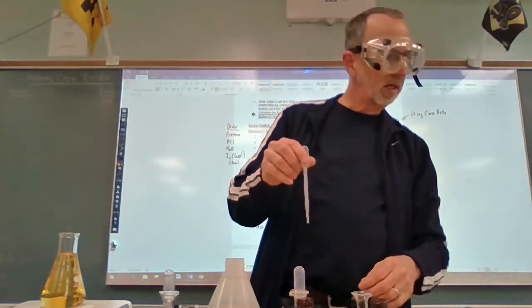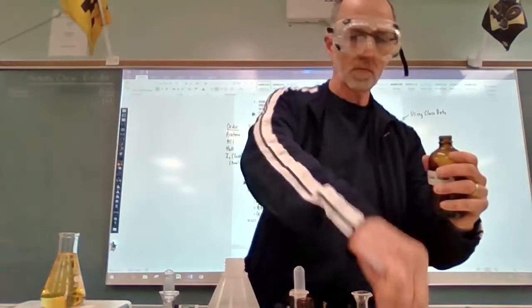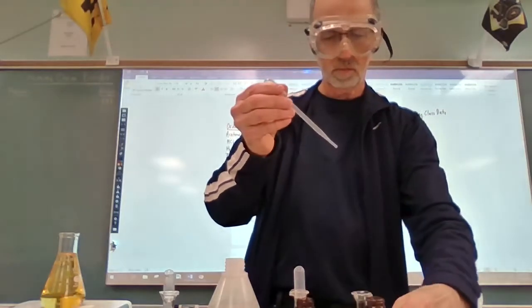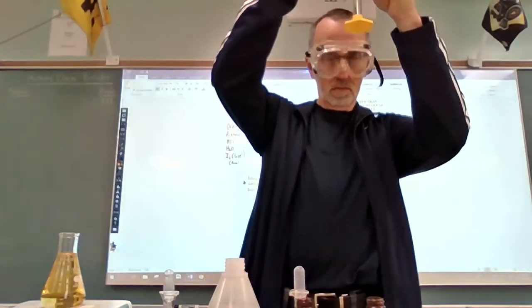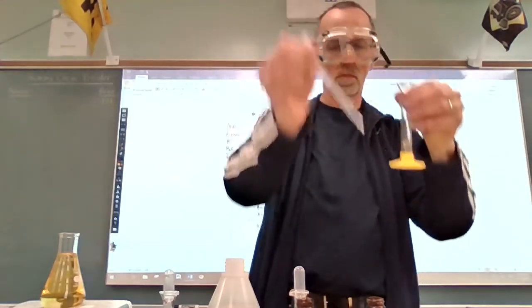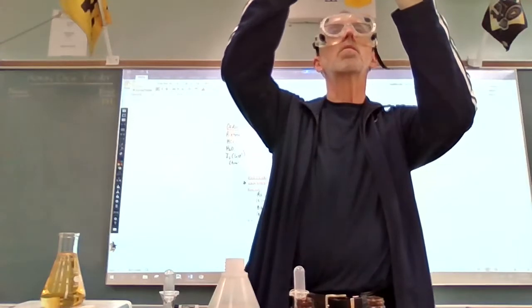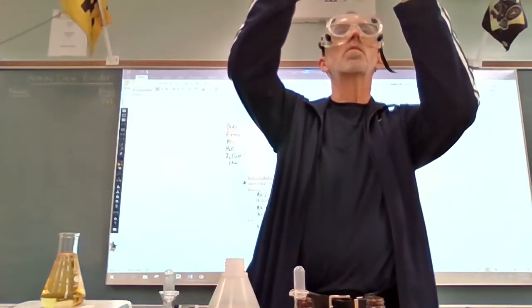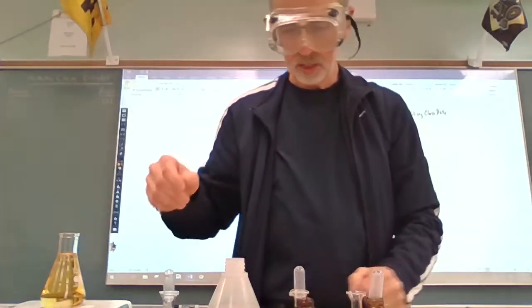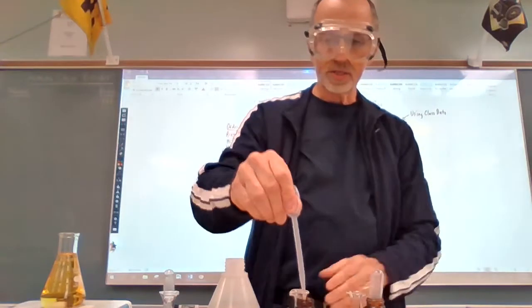And so I need 5 mLs of acetone. There we go. And then we will add 5 mLs of HCl.